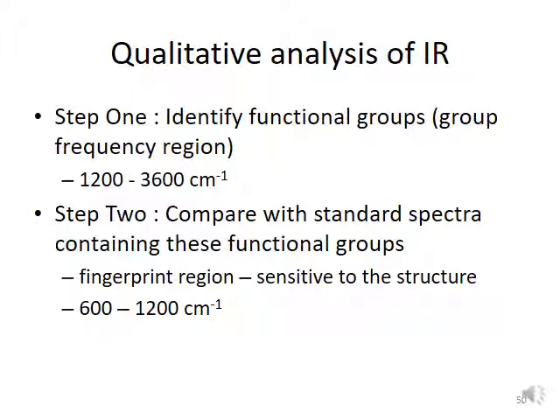This range is what we call the fingerprint region, and it is very sensitive to different structures, because if you have a different structure you will have a different fingerprint region. The shape of the peak is different, so that's why we call it a fingerprint region.